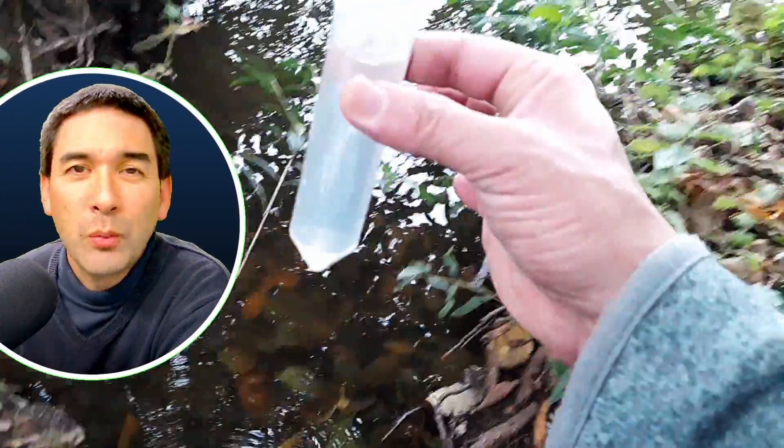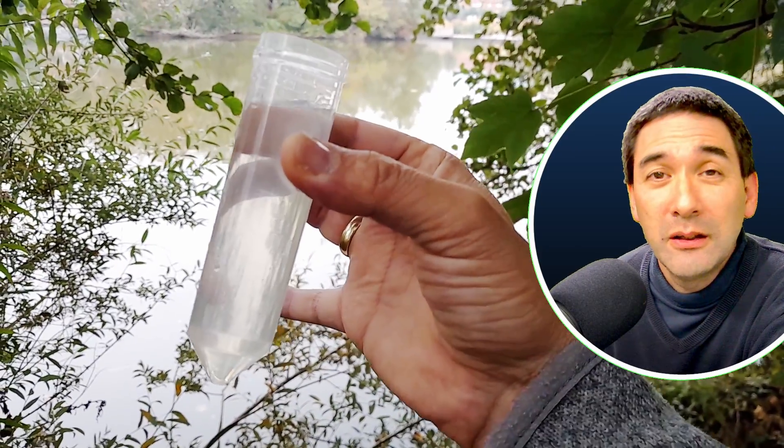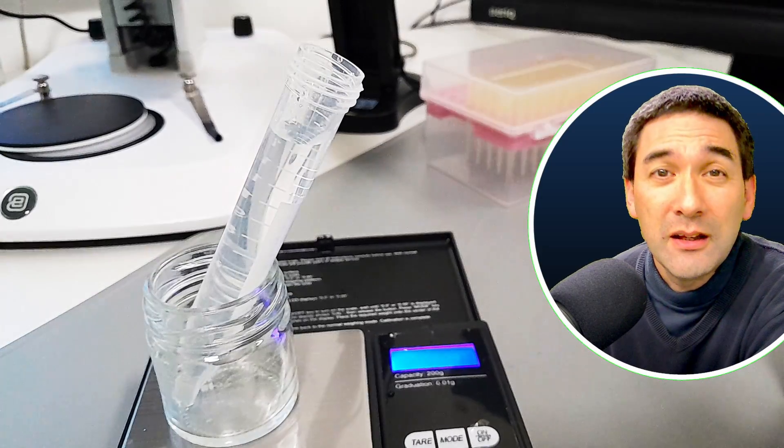And just by looking at the water, we can see that it's pretty clear. And it does look a little bit greenish and cloudy in the pond, but when you take out a water sample, it looks fairly clear. So I was a little bit concerned if there's enough algae in it or not.